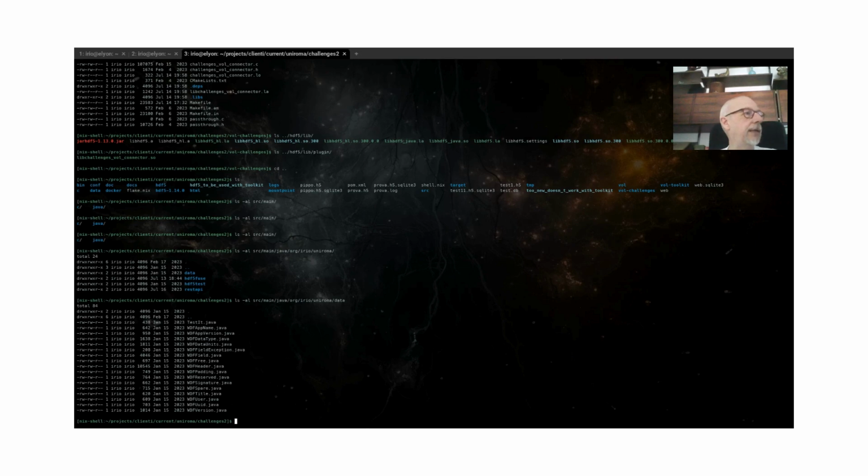So if it finds .wdf, it knows that that preprocessor is the one that manages that kind of file.